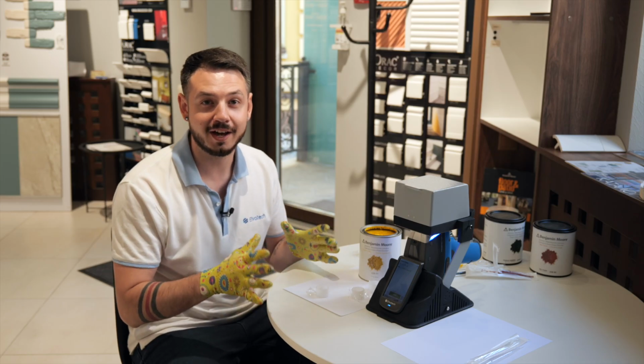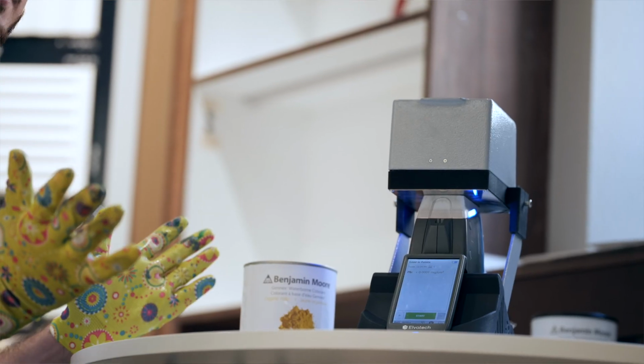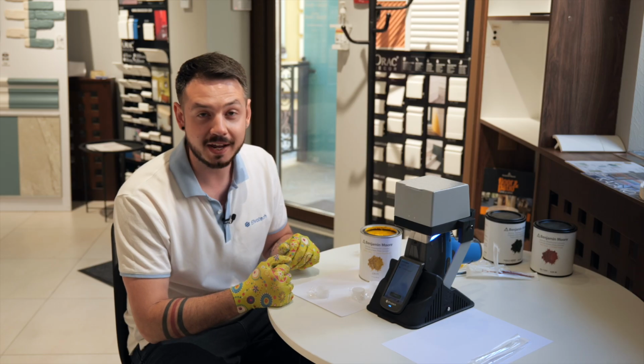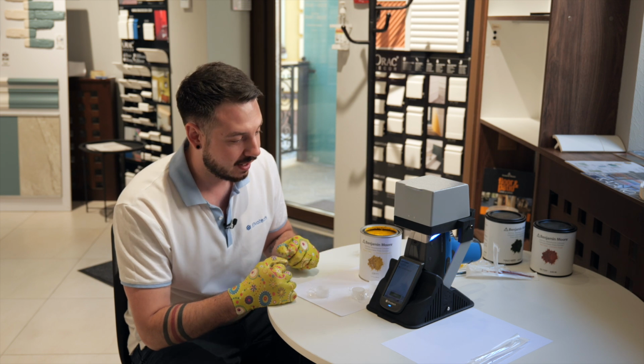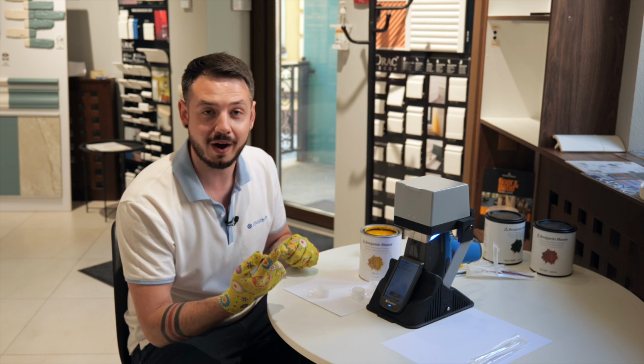Alright, and here we have a really cool and probably the best result that everybody can expect. The contamination of lead in this paint is only 0.0001.